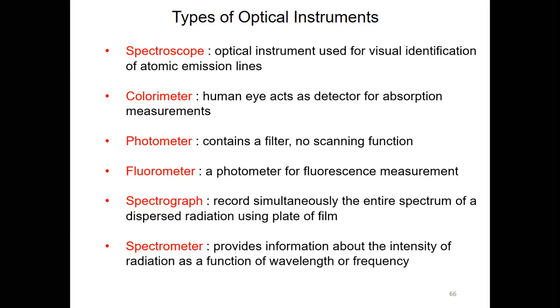Yes or no? No, madam. Okay, so you learned only how to do the analysis, the structure elucidation part and fragmentation patterns, all these things under mass. Here, under this instrumentation part, I will go through the basic components of the mass spectrophotometer. So let me share that presentation.